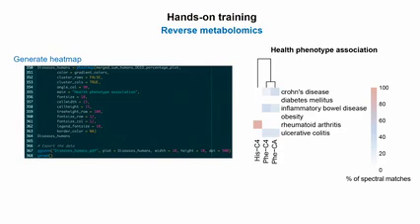Yeah, you can play with that. I think it depends. You get those matches sometimes, right? It depends how your molecule will fragment. Because sometimes with more peaks, your false discovery rate will be much lower. But sometimes you only deal with 4 peaks, and then you can have a higher false discovery rate. So in that case, you can definitely boost your cosine score. You can put 0.8 over 2, 3 or 4 matched peaks. You can also add that to boost your confidence.